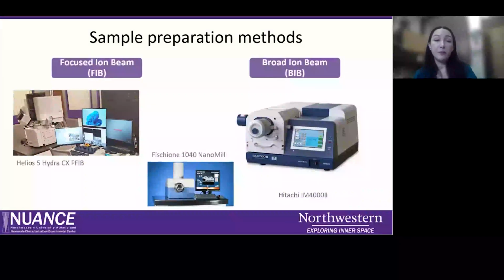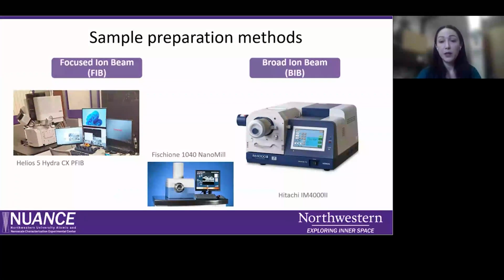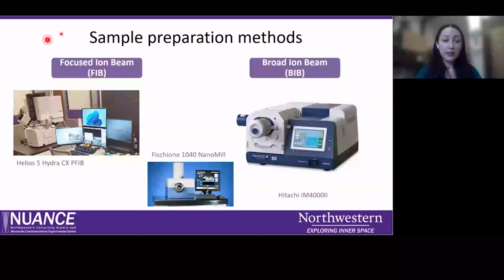You might already be familiar with focused ion beam, since Nuance is equipped with a plasma FIB and very soon a new gallium FIB. We also have a nanomill, which is another tabletop instrument. So you might be wondering how this compares with this new Hitachi ion mill. These are all ion milling instruments, but they work differently and they serve different purposes, which might be especially obvious between this focused ion beam instrument compared to these tabletop instruments just by the difference in their blueprints.